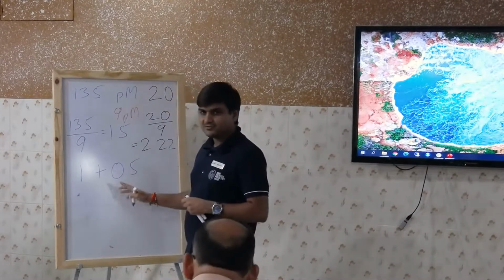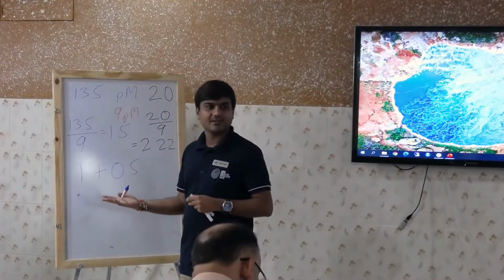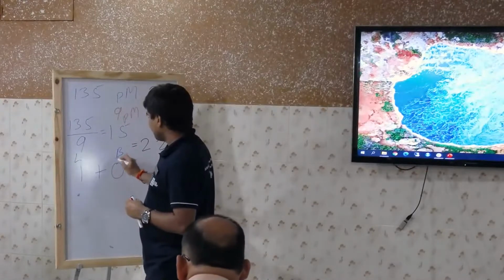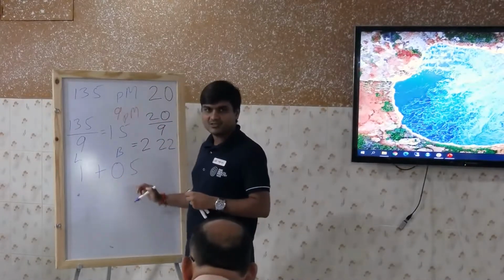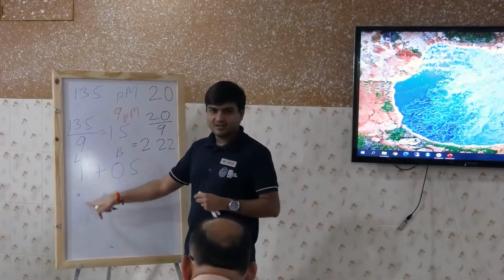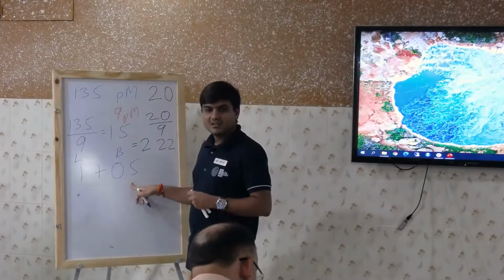This can be taken in terms of microliter, ml, liter, whatever unit you feel. Right? So finally, I am saying that my 1 microliter library plus 0.5 microliter buffer. Therefore, 100 microliter library and 50 microliter of buffer.